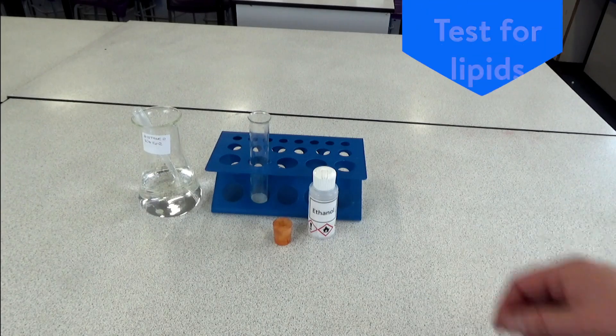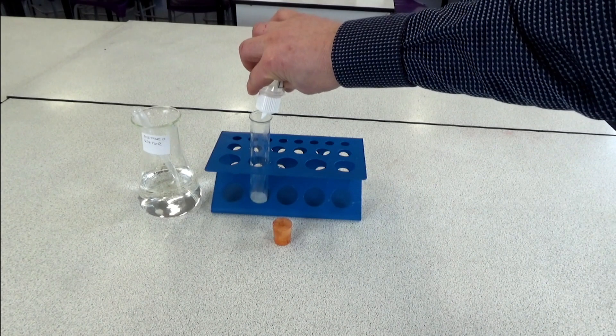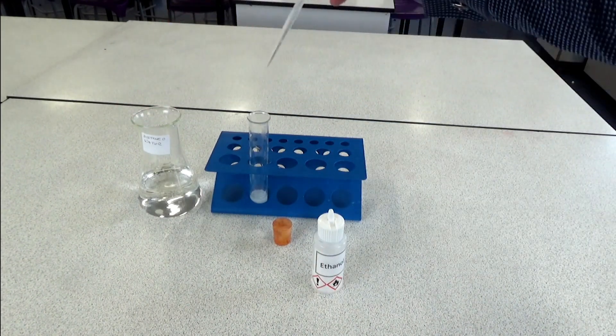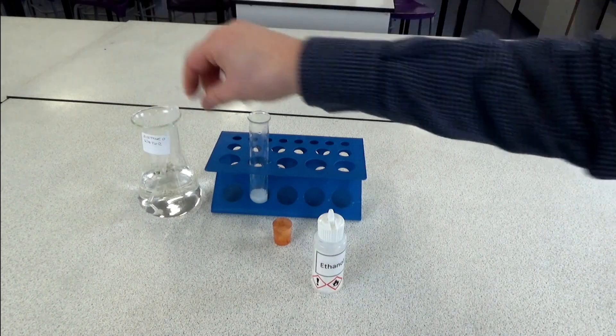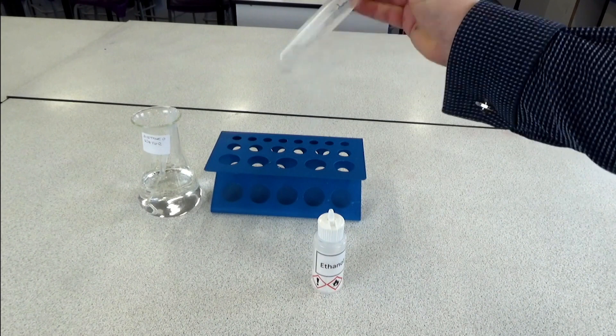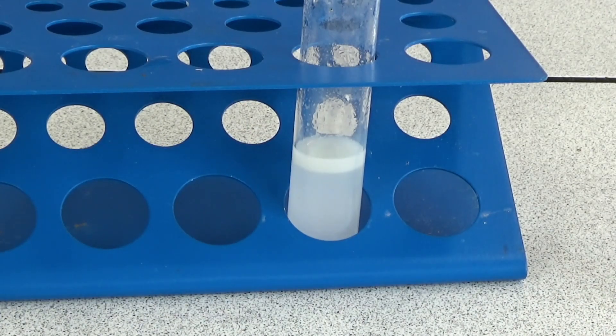The test for lipids is to add a few drops of ethanol to the food solution, then add a few drops of water, then shake the solution. The presence of an emulsion shows that the food substance contained lipids.